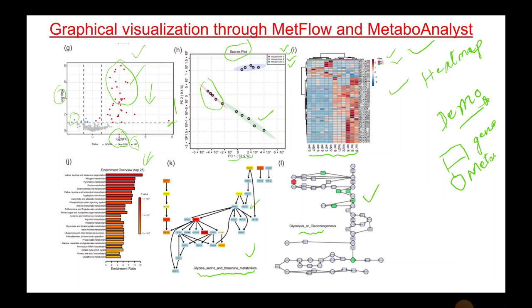Here you can see the different IDs. These IDs you cannot search directly. If you want to know what these IDs represent, they can be searched in the KEGG database. This ID is coding for metabolites. If you want more detail about this enrichment pathway, I have already recorded separate videos, so you can go and watch them to have a clearer idea.